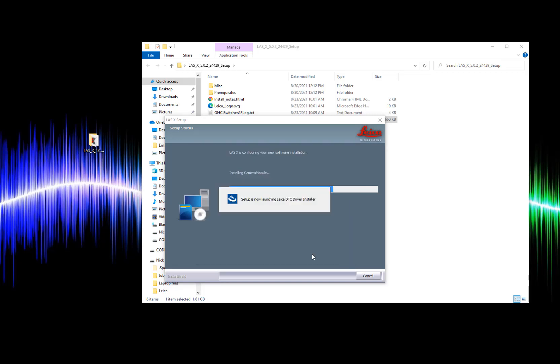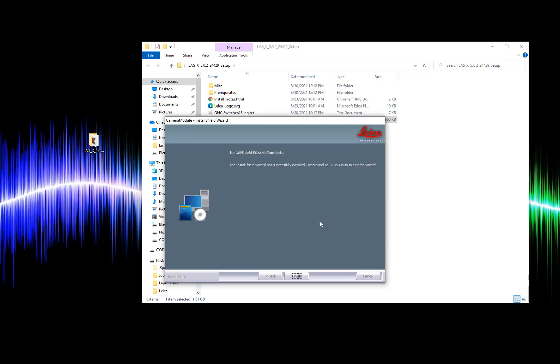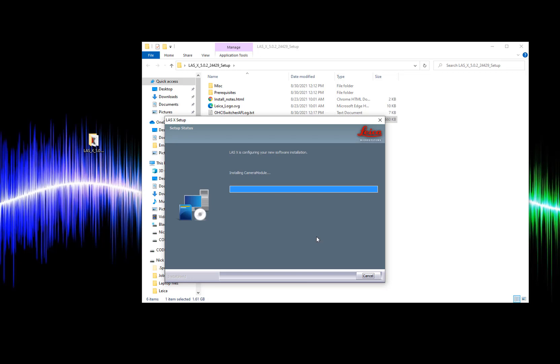As the installer finishes I'm going to hit next to continue through the windows and finally restart my computer at the end.